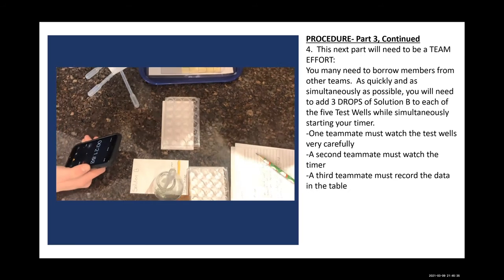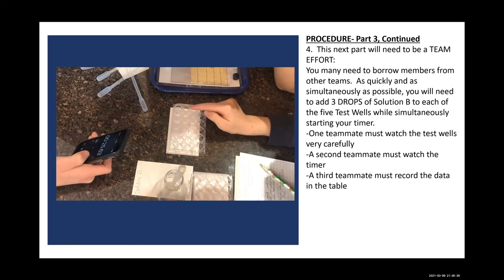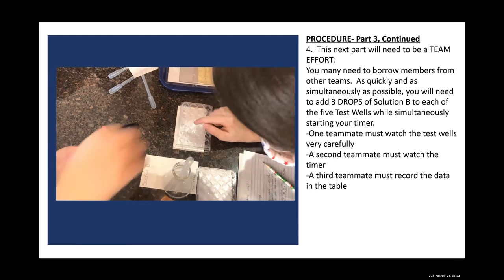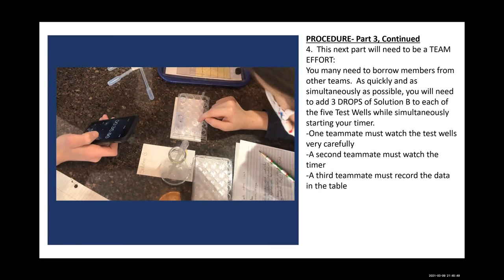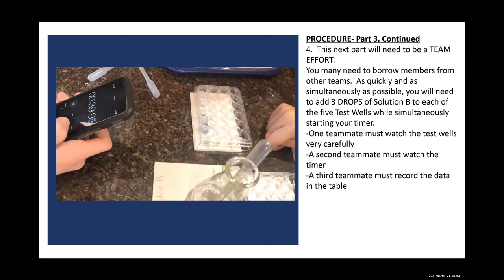Okay, first. Oh, there's some blue in the first. First two. In well 1, there's some blue in the next one. Yeah. At 17 seconds. There's blue right there. They all have blue in them. That's all of them, 30 seconds, 31. This one has a little blue in it. That's just really close.